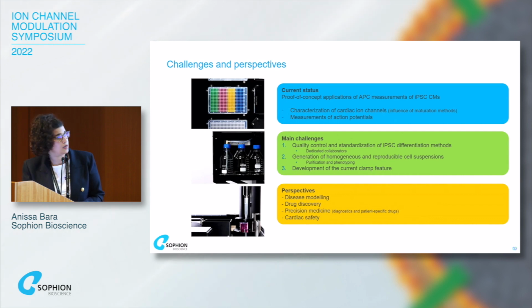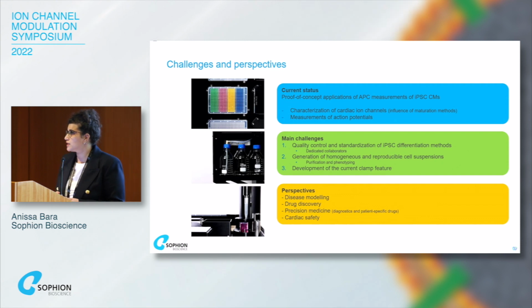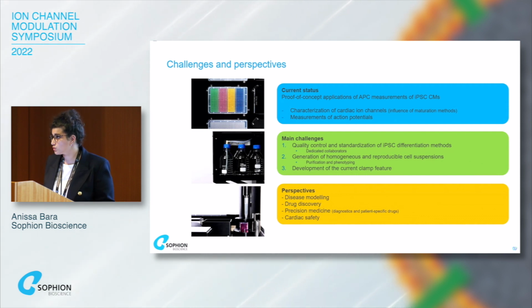And finally, I think the combination of the use of these APC systems with these iPSC-derived cardiomyocytes can really have an impact on disease modeling, drug discovery, drug safety, drug screening, and at one point probably personalized medicine.